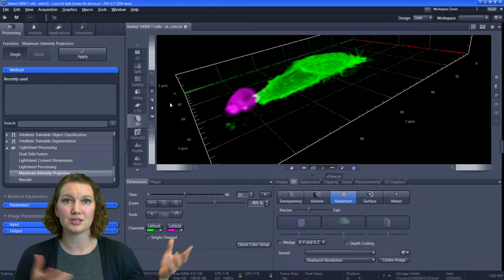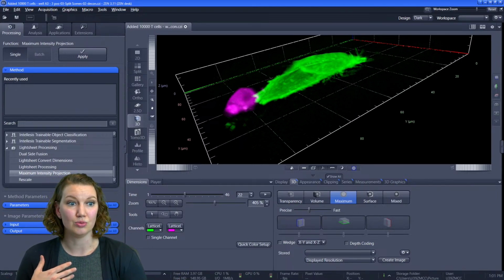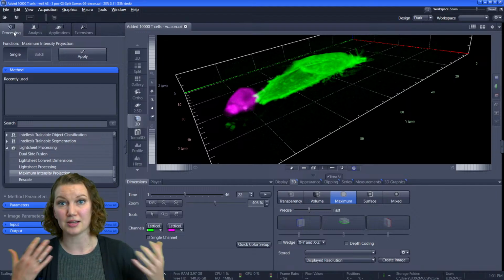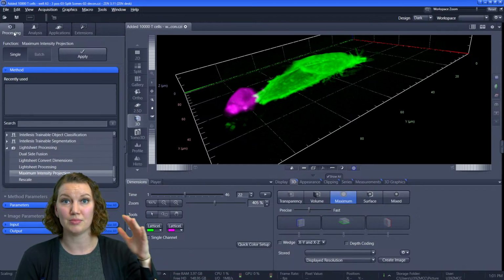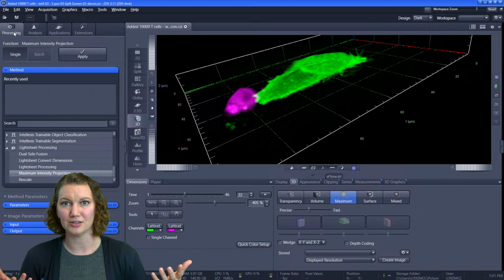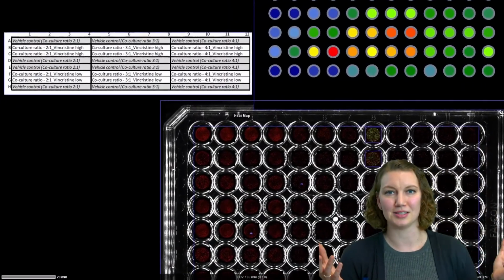So just an example here, this is a three-dimensional time-lapse data set, right? Normally, once you're done acquiring this on the instrument, then you have to go into the processing tab or potentially take it to whatever analysis software you use and do your post-processing steps there. Your post-processing steps might include things like deconvolution or turning your 3D volume into a max intensity projection so that you can watch your time lapse more easily in one dimension and see what's going on. Stitching your basic Widefield images. Most of us who are doing microscopy are not exempt from having to do post-processing steps, right?